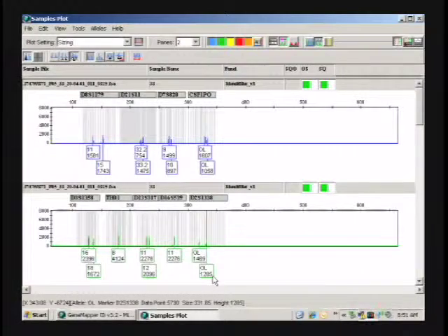If somebody's mini-eluting and every time they were getting this result where they're getting everything, but just the last couple, just those two loci for some reason are off ladder, then you may ask them, hey, did you do your 1 minute dry spin? Did you try reanalyzing that with a ladder that's closer to it only? Well, this is actually pretty close. Like the number 2, that one was right next to the ladder. It was? Yeah. And they were injected at the same time? Yeah. But it's averaging, it's using the other ladders to size that, so it's probably just a sizing problem.